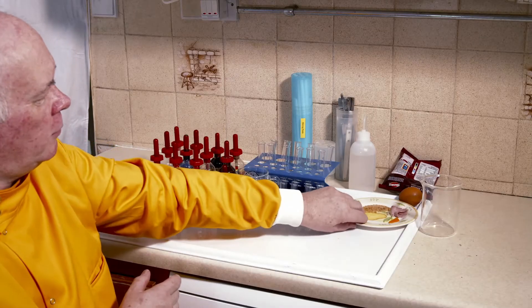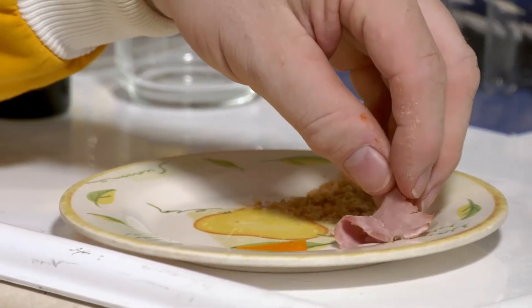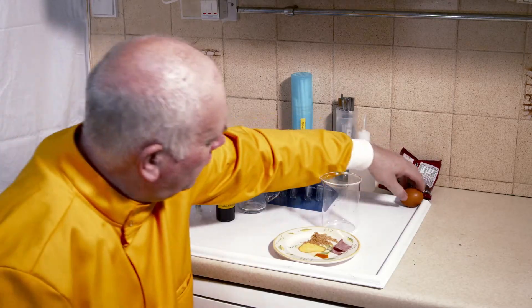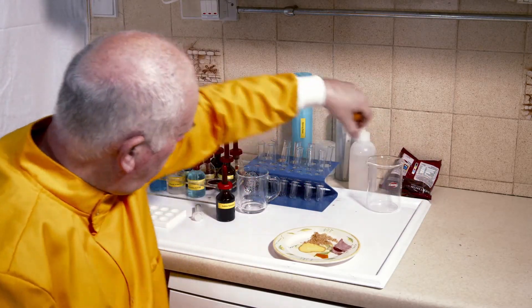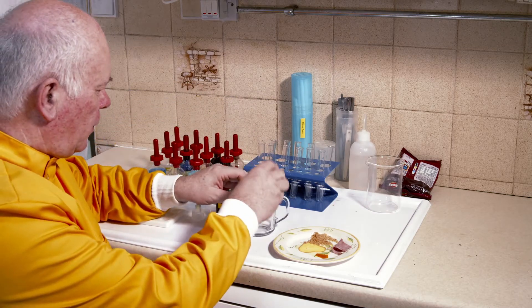I've got a selection of different foods here. I've got some breadcrumbs from my meal, some ham, a piece of cheese, and we've also got an egg that we can have a go at.